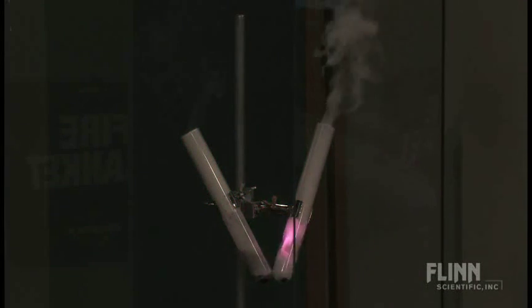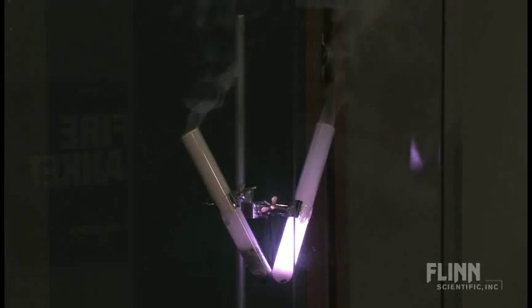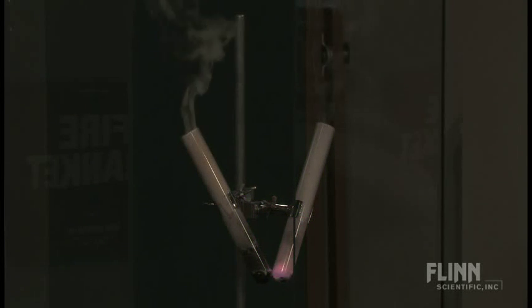So you can see the really brilliant gold flame on the left side for the sodium, and then the bright lavender flame that's being formed on the right side from the potassium. So the sodium gave us the gold flame, the potassium gives us the lavender pink flame. So you can tie back in the periodicity and atomic structure that you covered at the beginning of the year with another demonstration at the end.